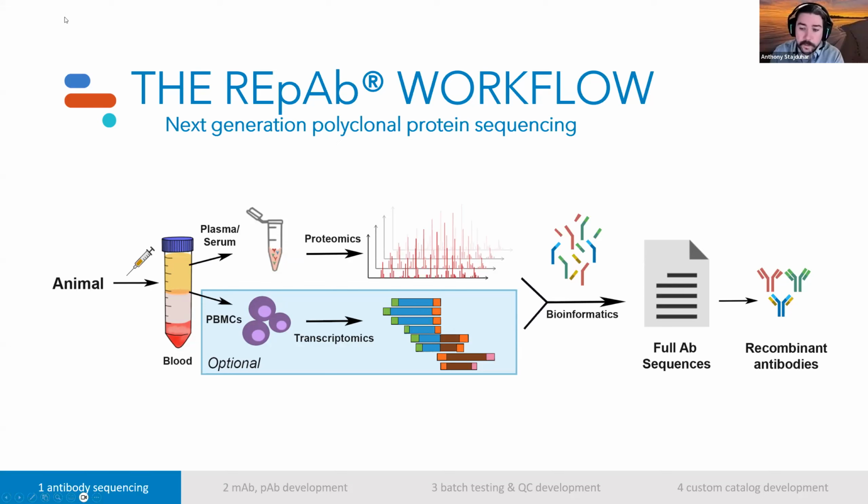We've been able to successfully work with a number of different antigens now. Of course, peptides are quite common. Many soluble proteins, in particular some GPCRs, which are amenable to a soluble kind of format. And we've been able to work with some larger targets as well. So we're happy to say that the technology has been quite successful and robust so far. But it really hinges initially on the purification of the antibodies against your target of interest in the assay or in the functional way in which you expect to see them, right?